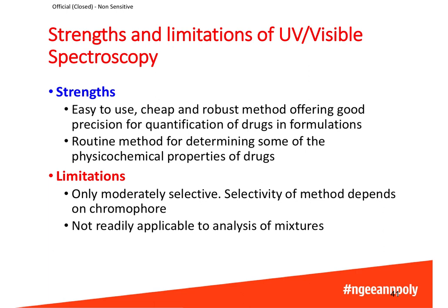UV spectrophotometry is also more suited to analysis of one single analyte and not so much for analysis of mixtures unless it is paired with another method such as liquid chromatography.